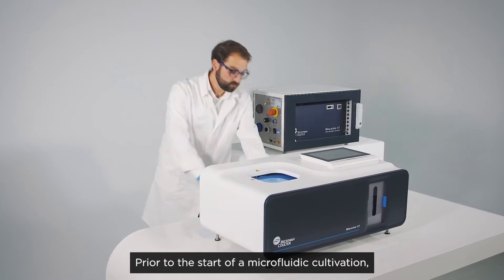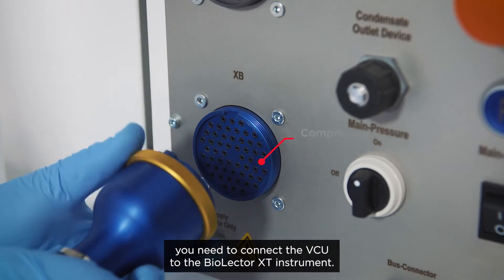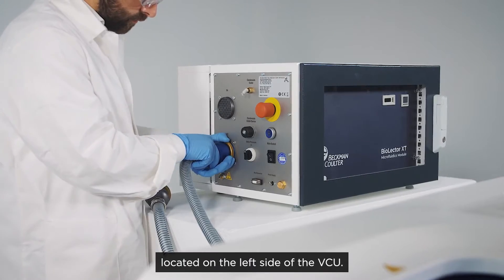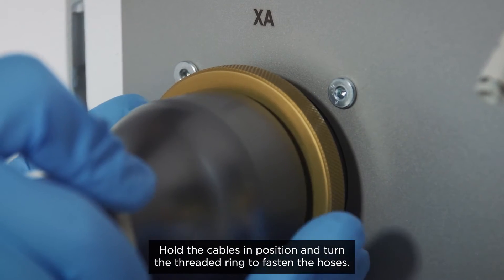Prior to the start of a microfluidic cultivation, you need to connect the VCU to the BioLector XT instrument. Screw the two compressed air hoses onto the threads located on the left side of the VCU. Hold the cables in position and turn the threaded ring to fasten the hoses.